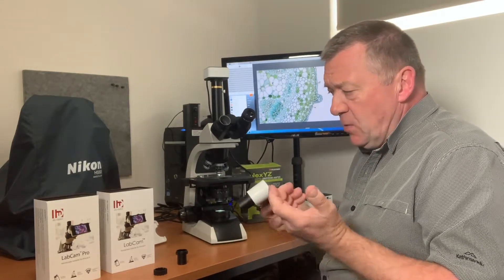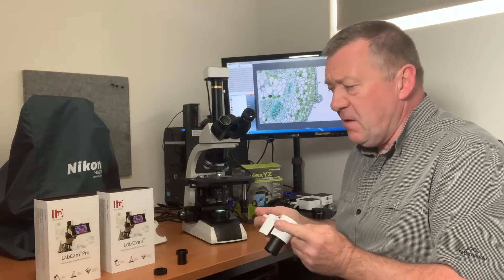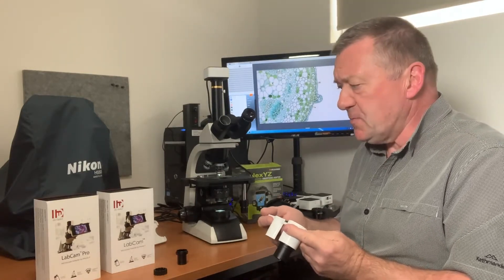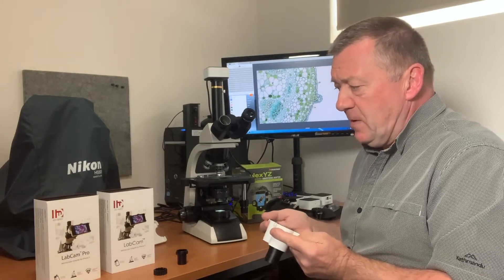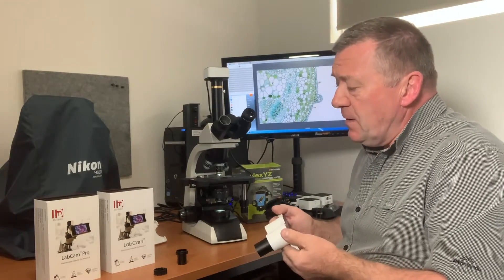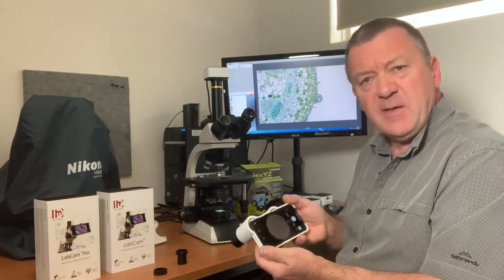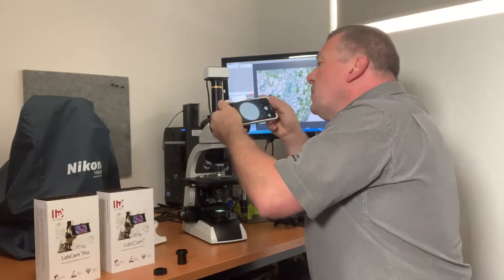I did find a drawback of using the LabCam adapters: when you upgrade your phone you can't use the adapter — you have to buy a new one. They are quite expensive at four and five hundred dollars, and if you change your phone every two years it can get quite an expensive habit, unless you keep your original phone to use with the adapter. I'll just show you what both look like on the microscope. You open up the camera on your phone and it fits into the eyepiece.